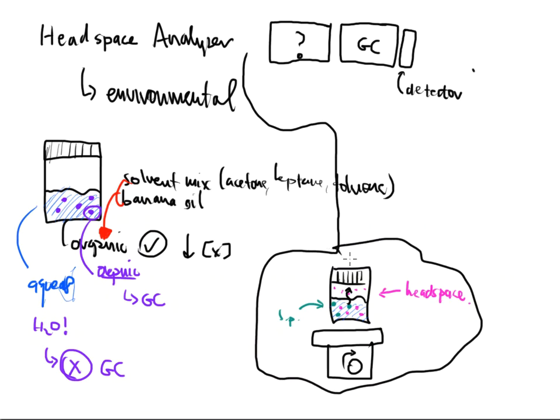That's its whole purpose. I don't want to be over at a hot plate heating closed containers up, trying to keep everything consistent as far as the heating goes, trying to keep everything consistent as far as the timing goes. It's going to drive me crazy. So the headspace analysis will do it.